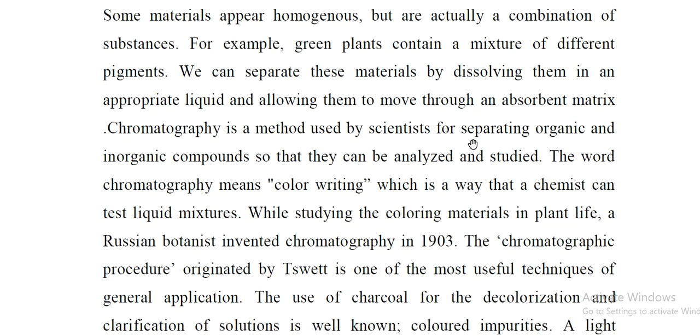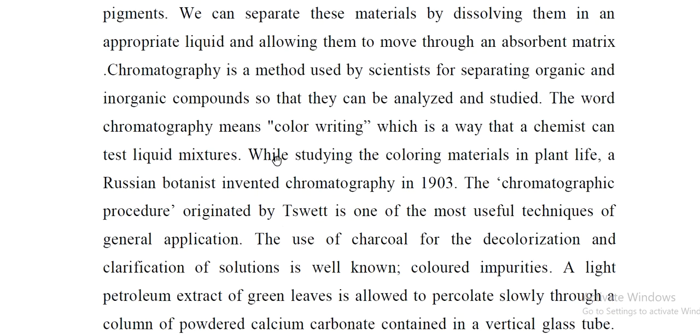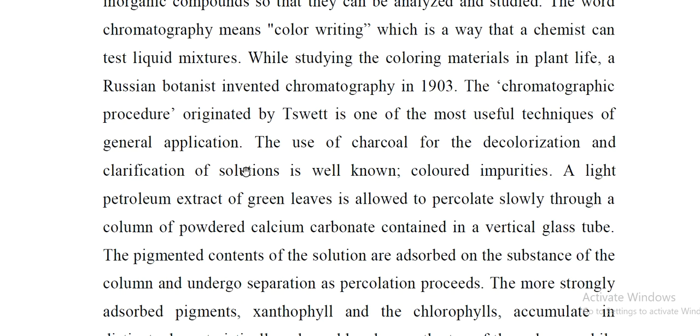Chromatography is a method used by scientists for separating organic and inorganic compounds so that they can be analyzed and studied. The word chromatography means color writing, which is a way that a chemist can test a liquid mixture. While studying the coloring material in plant life, a Russian botanist invented chromatography in 1903. The chromatographic procedure is one of the most useful techniques for general application.